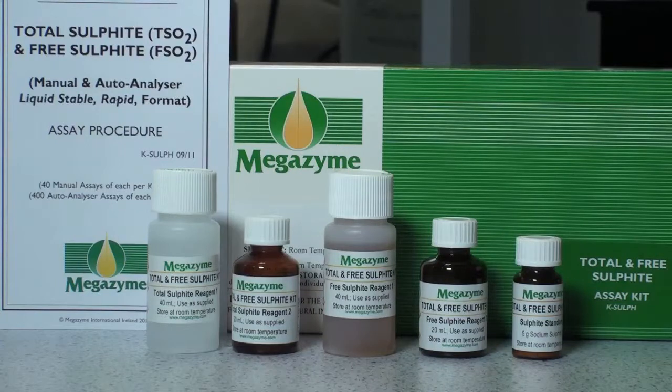As delivered, the kit should contain one instruction booklet, one bottle of Total Sulphite Reagent 1, one bottle of Total Sulphite Reagent 2, one bottle of Free Sulphite Reagent 1, one bottle of Free Sulphite Reagent 2, and one bottle of Sulphite Standard.